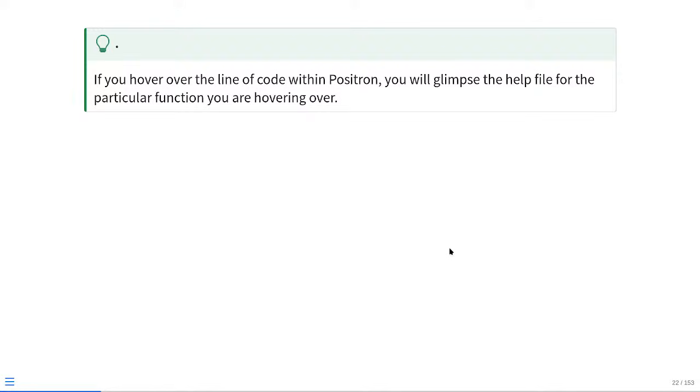All right. We have a question on the chat about RStudio. Will it be sufficiently different from Positron if they need to switch over to Positron for this course? So Positron and RStudio are made by the same company, Posit. Positron is one of the newer versions. It's come out within the last 2 years. The reason we're using Positron is it's a lot easier to use in a lot of aspects than RStudio. So a lot of the things that used to be hidden several menus back are right where you need to see them. They're quite obvious.